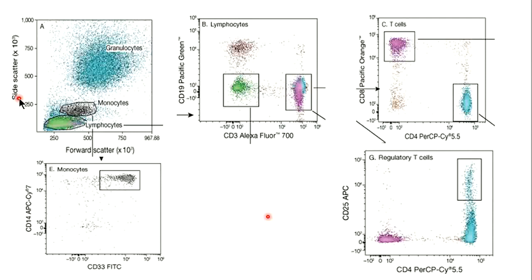Everything depends upon how much complexity you are analyzing, how many antibodies you are adding, how many proteins simultaneously. If you have knowledge of compensation, you can go up to 18 till now. So 18 is, I think, the limit of modern flow cytometers, where you can analyze 18 proteins simultaneously, meaning 10 to 15 types of populations. Amazing technique, done in half an hour to 1 hour of experiment. Obviously the analysis part is longer, but performing the experiment is easy and high throughput.